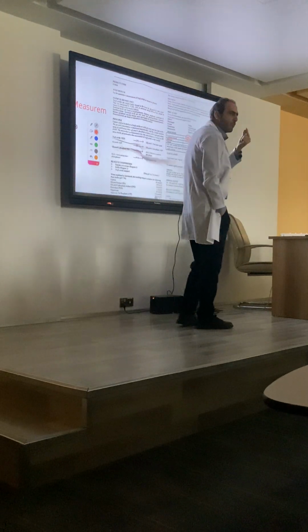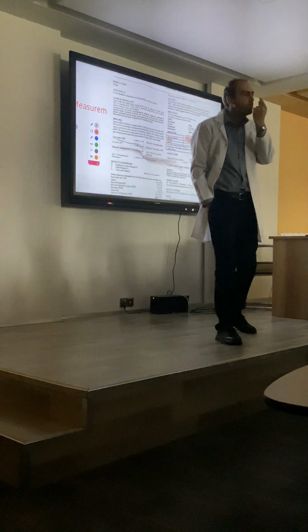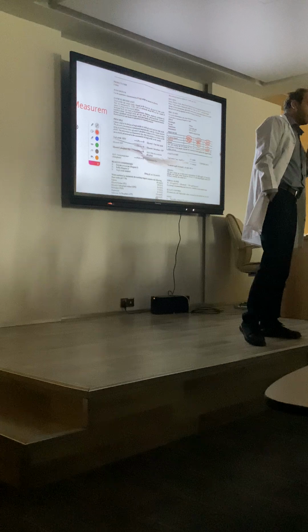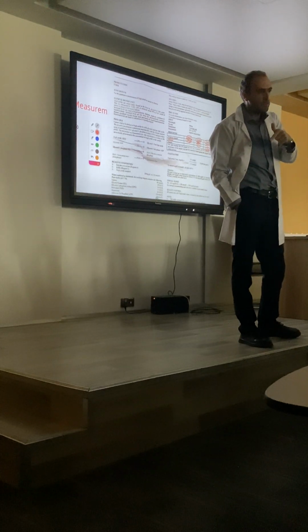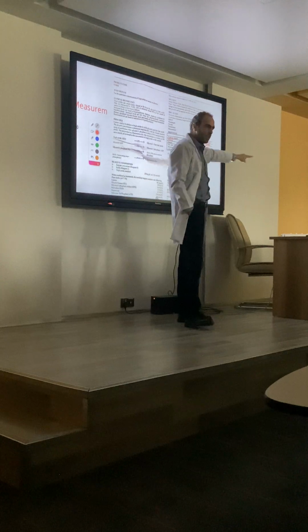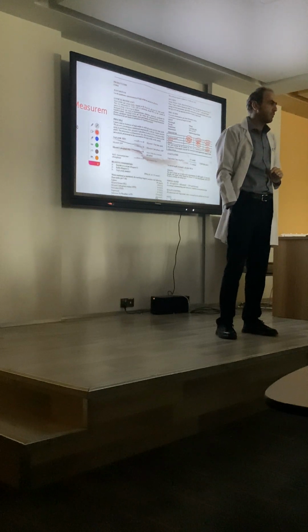So, be careful. When it says 10 microliter, you should take 10 microliter. If you take more, the OD is more and the concentration is high. If you take less, the OD is less and the concentration is also low. So if you get the wrong result, it's because of your sampling. You weren't able to take the right amount of the 10 microliter.